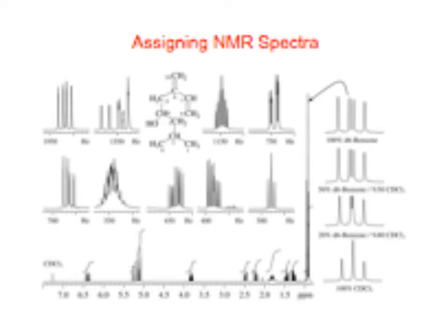As you can see, as the frequency goes down, right? They put these in hertz here, so I think you could maybe estimate the size of the coupling constants if you wanted to. It'd be easier to interpret if they just put parts per million up along there, and then you'd know right off the bat which ones are which. It's the same size. So this has got to be it.